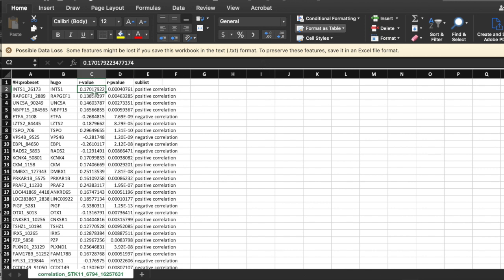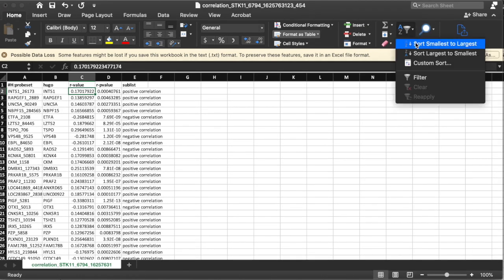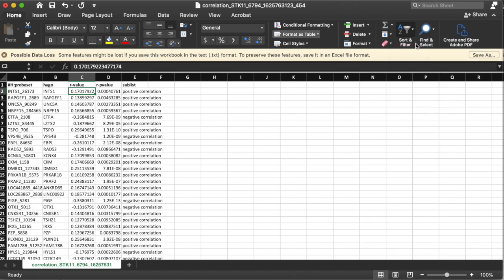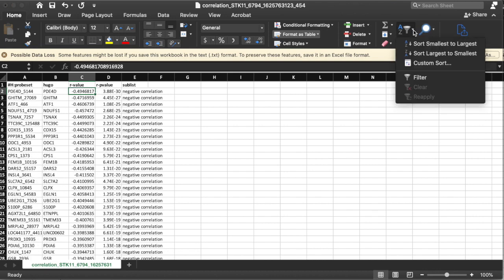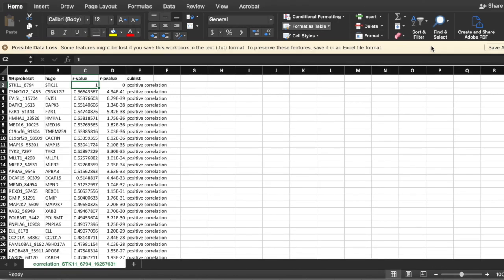Then what we're going to do is we're going to sort largest to smallest. Does everybody now have STK11 as your top gene? Everybody with me so far?